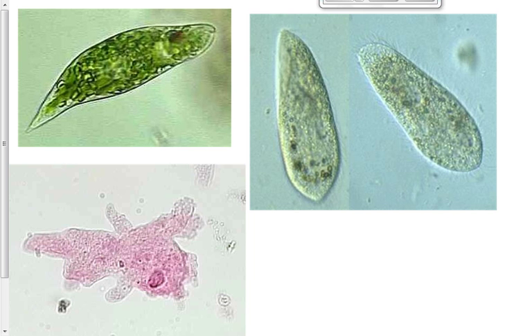This is the paramecium. Paramecium is kind of oblong in shape, similar to the euglena, except the euglena has the one single tail, whereas the paramecium have cilia. I don't know if you can see it really well here, but you can see kind of a blurred edge. Here you can actually see them quite well on this one on the right-hand side. These are cilia. They look like hair, but they're not. That's how the paramecium moves. It waves these hairs in kind of unison, and it can propel itself very quickly.